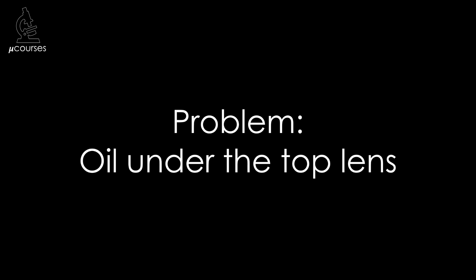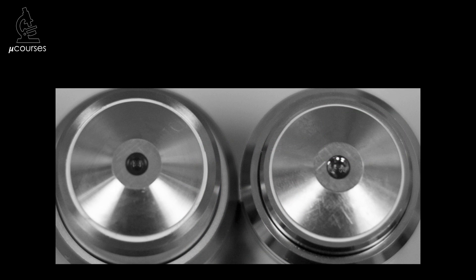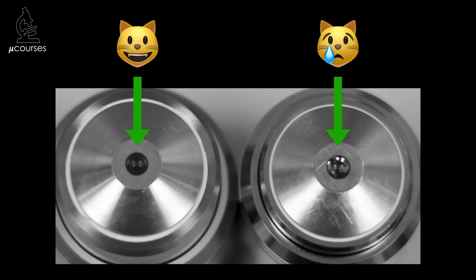Another problem that can occur is immersion oil seeping underneath the top lens of the objective. Over time, the cement that holds the top lens into place can become porous, and immersion oil can seep through those pores and get underneath the top lens. It can be difficult to identify oil under a top lens at first — it's easiest if you compare it to a lens that's fine. The lens that has oil under it will show the reflection of that oil underneath the top lens. Unfortunately, if oil does accumulate under the top lens, the objective lens needs to be shipped back to the manufacturer so they can take the top lens out, clean it, and replace it.